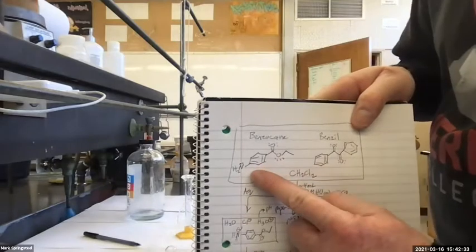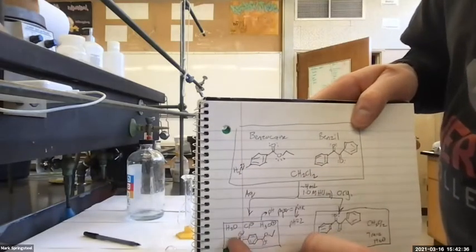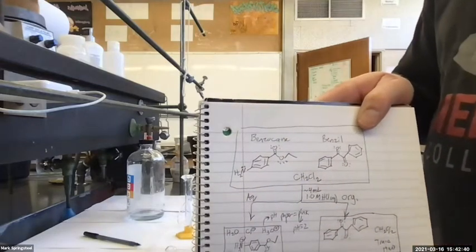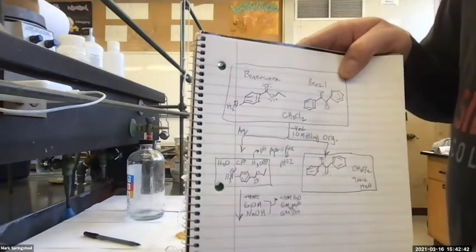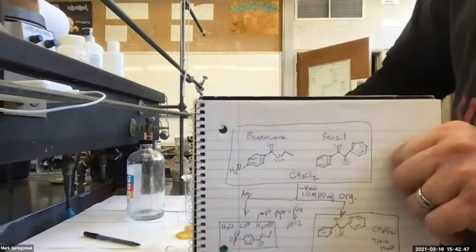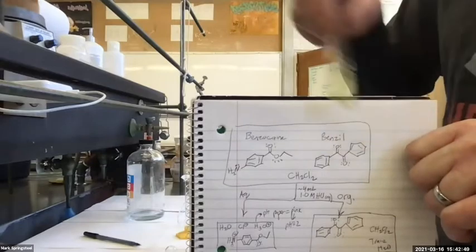That white stuff is benzocaine. We deprotonated the ammonium. Now it's not very water soluble, so it precipitates out. There's no organic layer for this to dissolve in. We're over here on the aqueous side. The organic layer is off over here. Methylene chloride's over here.